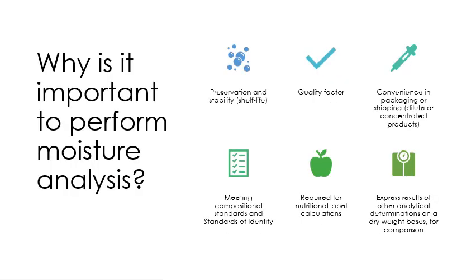So you may wonder why it is important to perform moisture analysis of food. This is important because it indicates preservation and stability, especially if you are studying shelf life. It's also one of the quality factors.